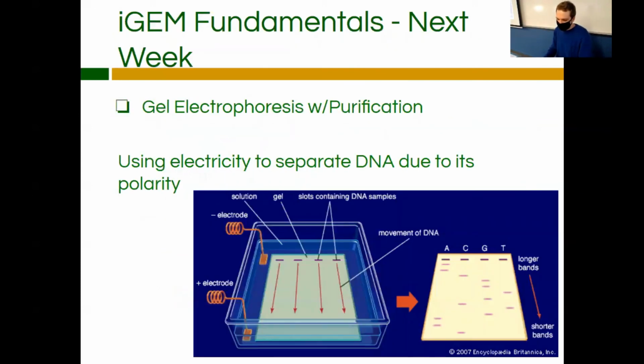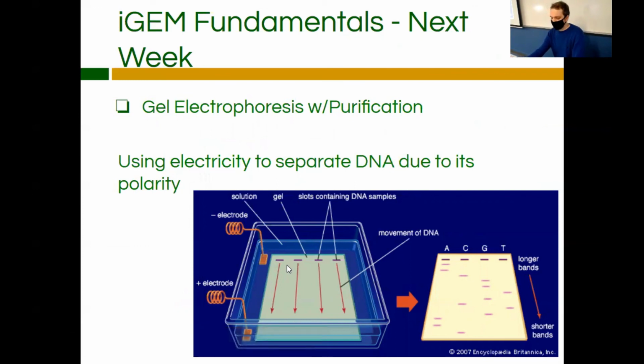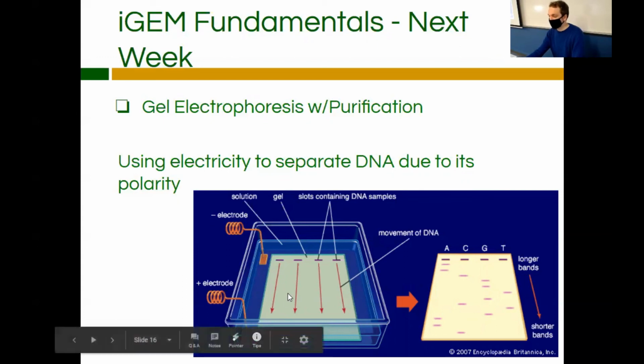So next week, I'm going to be going over gel electrophoresis. I think I'll touch on 3A assembly as well. Gel electrophoresis, in a nutshell, is just using electricity, electrodes, in order to separate DNA. I don't know if you've done this before. It's pretty commonplace in wet labs. But you have a positive and a negative electrode, and the DNA runs to the red, or runs to positive. So it can separate depending on the size of the part.